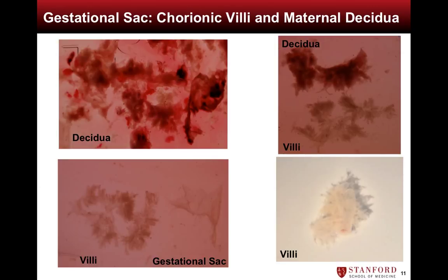Differentiating chorionic villi from maternal decidua can be challenging, so we demonstrate several examples here. The top left image is of decidua, compared to the delicate villi shown on the bottom left, adjacent to the almost transparent gestational sac. On the right we show an example of decidua adjacent to villi, and below an image of villi alone. Notice the delicate, frond-like architecture that is characteristic of chorionic villi.